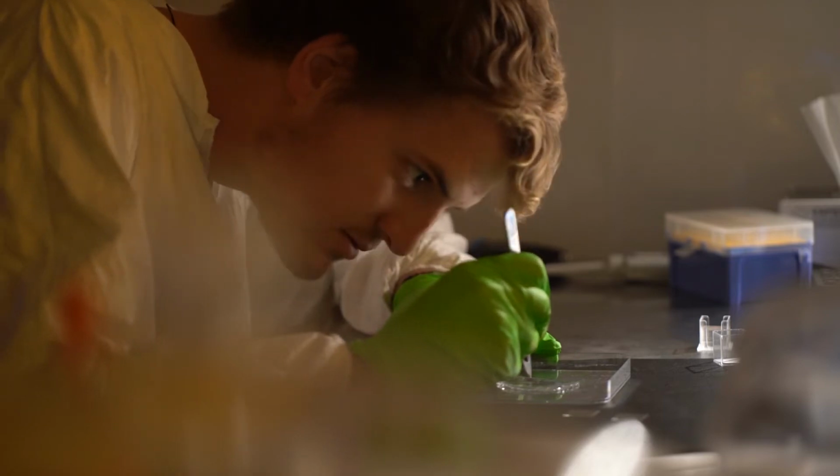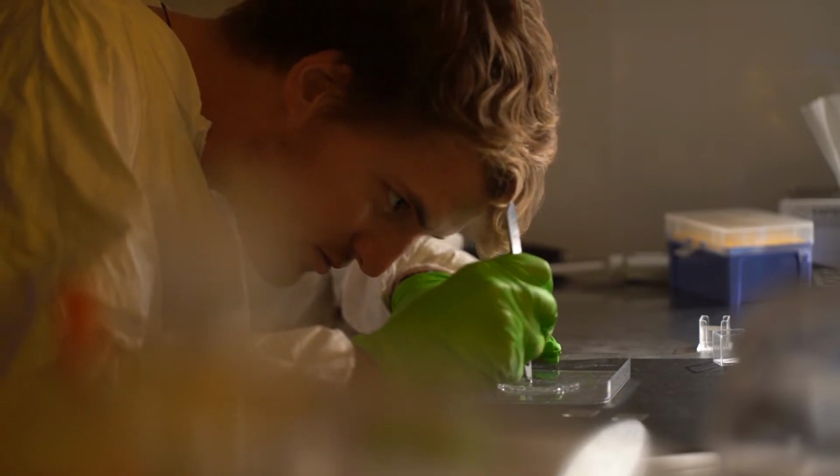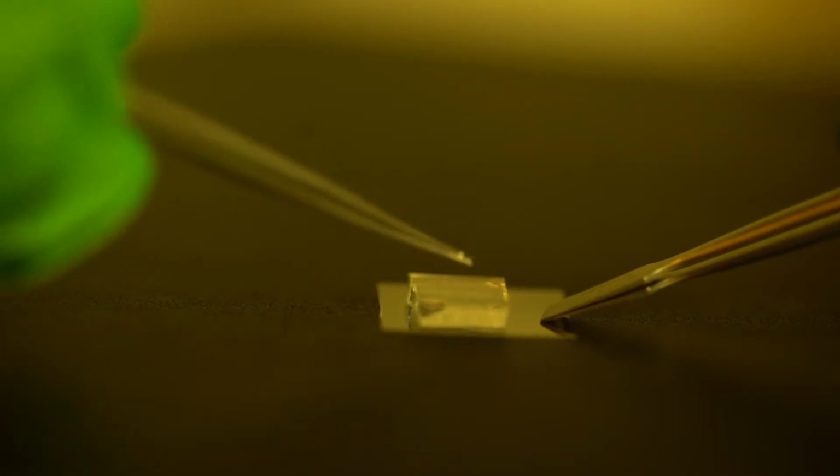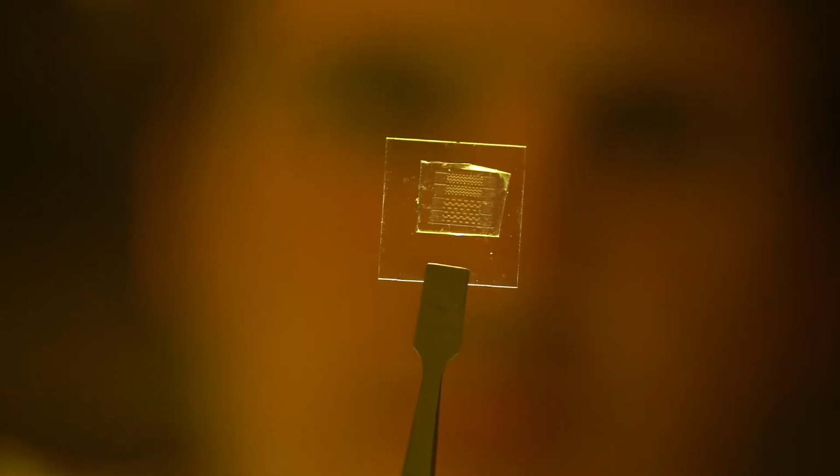This master was further used as a mold to cast an elastomer, which was baked, and the working area was cut out to obtain a maze with hundreds of mini buildings.